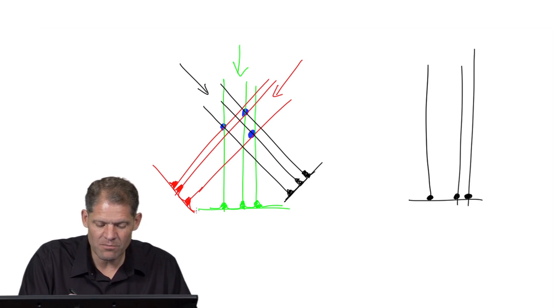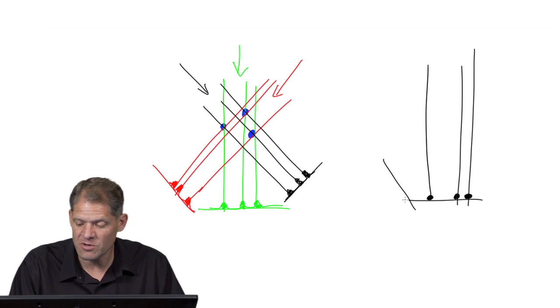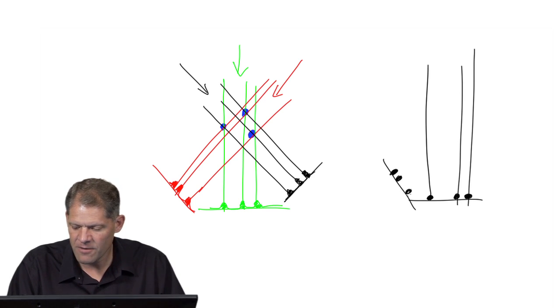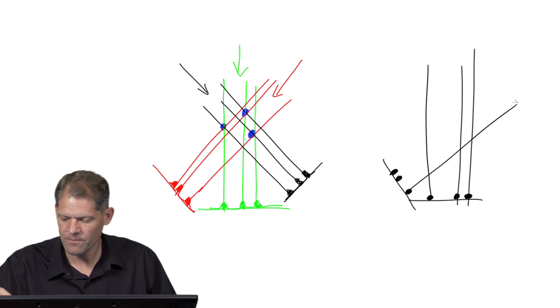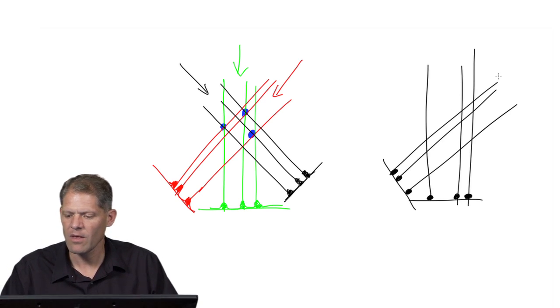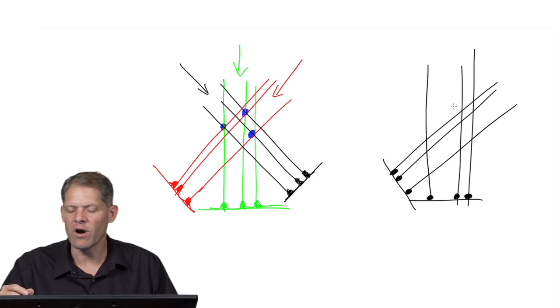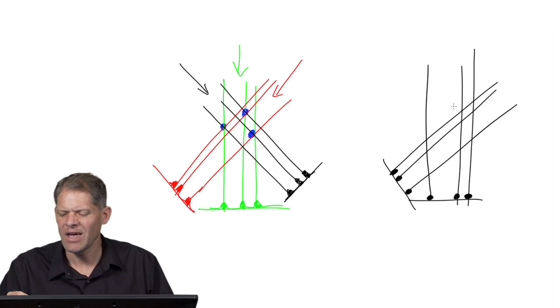But now we take our second projection image, and assuming that we know what the relative orientation between this projection and this projection is, this allows us to say, okay, well, there was a density there, there, and there in this direction. And so now we have really 9 candidate positions in the reconstruction volume where our three components might be found. And we can't tell which one is the correct one yet.